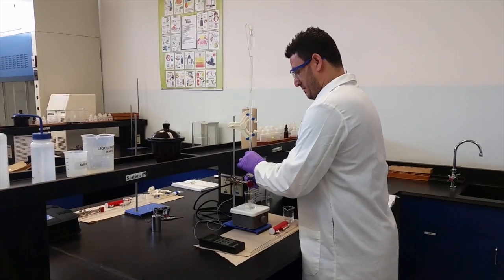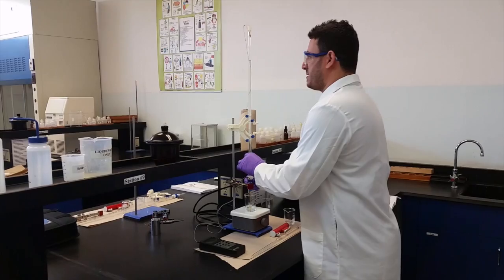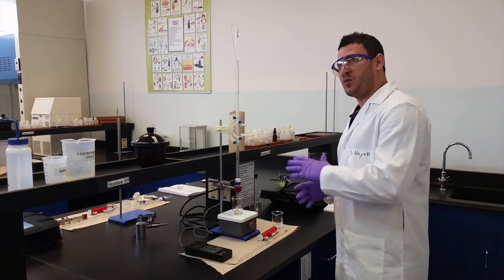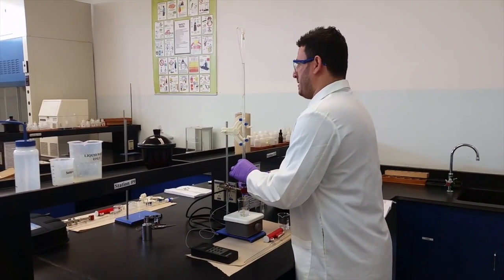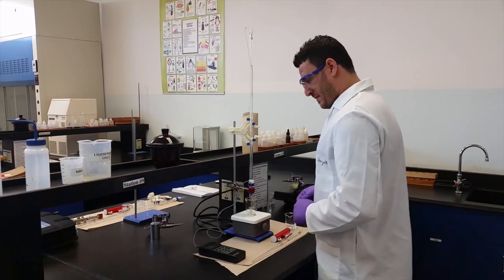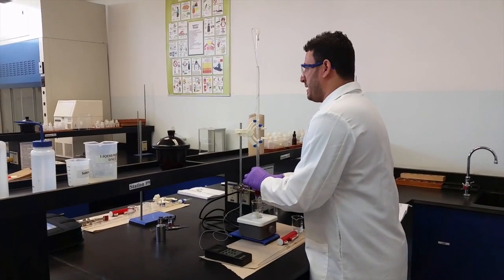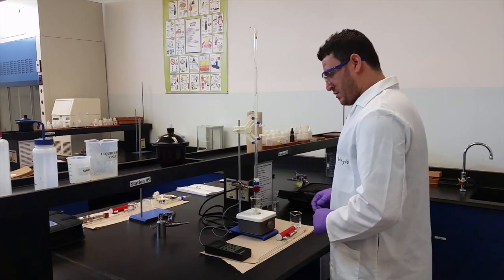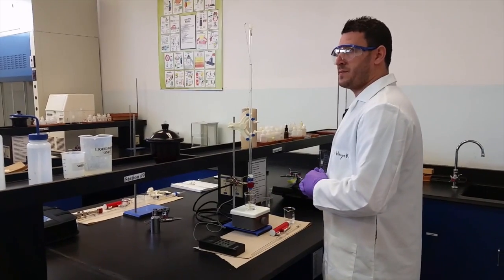Okay? Which I don't want to call a buffer area since you cannot form a buffer solution with a strong acid. You will see it more with the weak acid. Okay? But now you can see that the pH starts to increase. So you have to add 22 milliliters of potassium hydroxide. So every time you add 1 milliliter, you wait for your pH to stabilize.